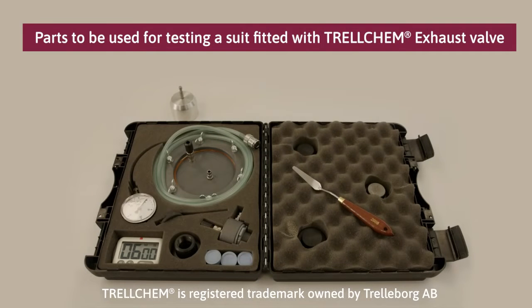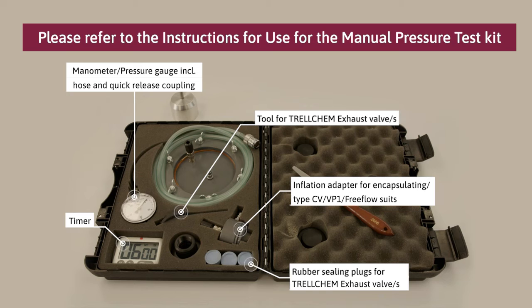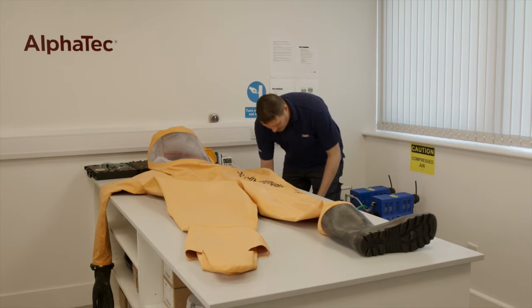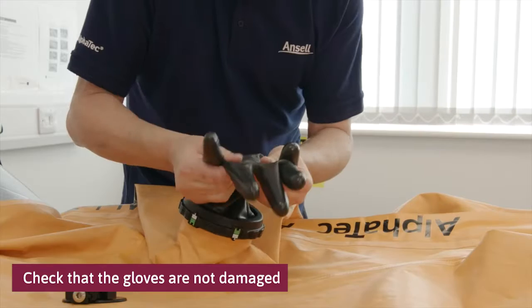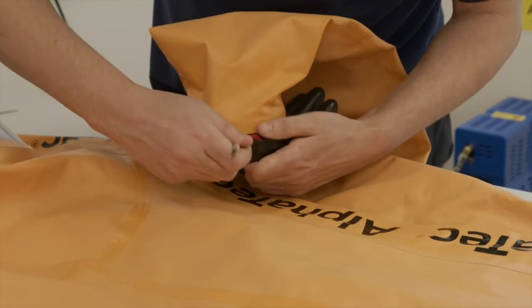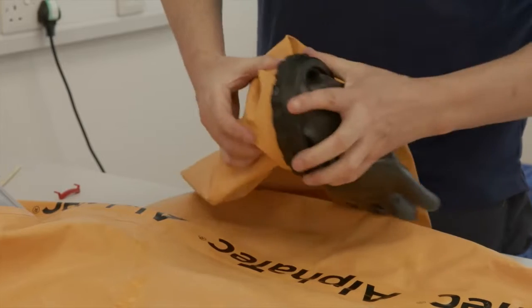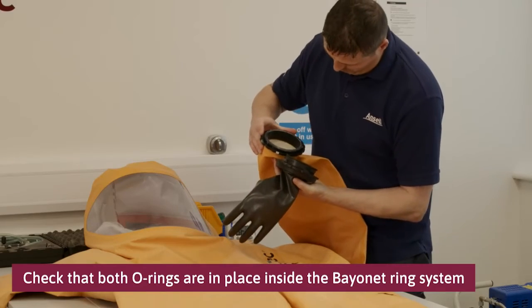If you have an older suit fitted with the Trelchum exhaust valve, these are the parts you need for testing. The following preparation steps need to be performed prior to the actual pressure test. Check that the gloves are not obviously damaged or have holes. Check that both o-rings are in place inside the bayonet ring system.